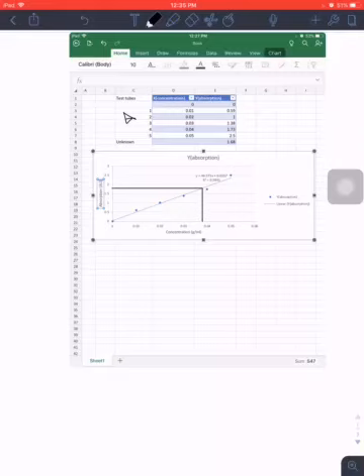Alright guys, for this video I'm going to be showing you how to calculate the concentration of an unknown value using absorption. First of all, our samples are Kool-Aid samples that we did during the lab, where we had known concentrations of Kool-Aid mix within water, and we used a spectrophotometer to measure how much the Kool-Aid absorbed. We found that the stronger the concentration is, the more the absorption is, which we'll go into later.